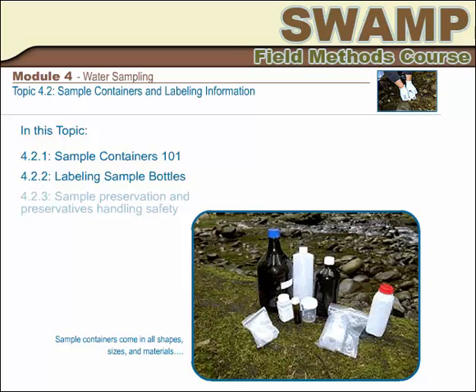This topic shows only the general approach, and the reader is urged to check out the details in the latest version of that appendix. The same is true for the way that samples should be labeled, and for the need to preserve them. Details cannot be specified in this topic, but it is your responsibility to make sure you get all the information that is relative to your effort. Click on a subtopic to start, or click the next button to see them in order.